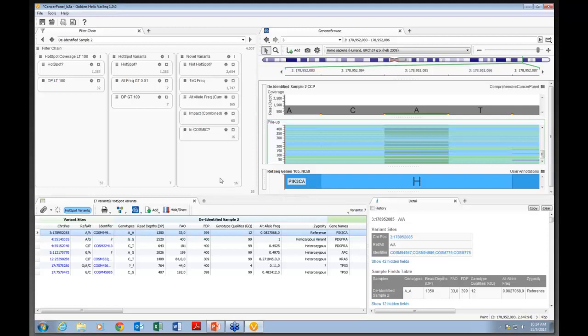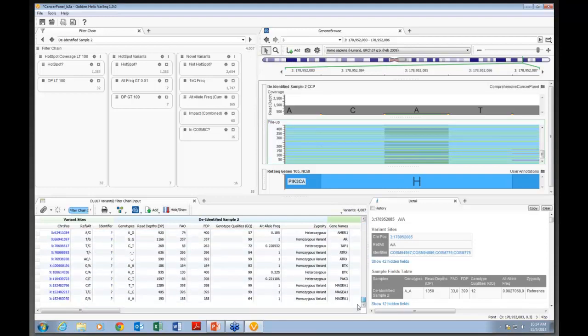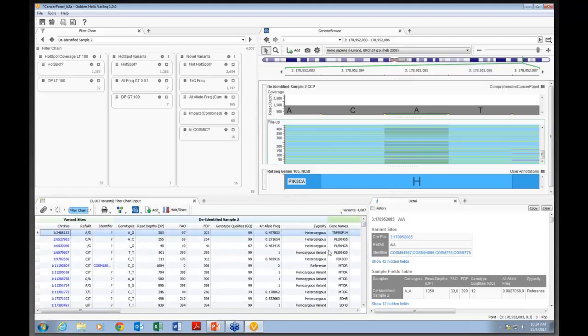And at the bottom, we see exactly how many variants passed through each one of these outlines. Now what you'll find is that as you click on any one of the numbers in this table, this data table at the bottom updates to represent all of the captured variants. So when I click on the number 4007, I see a listing of all of the 4007 positions that are found within the current VCF file.